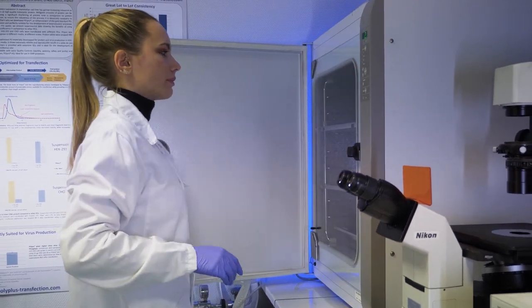Chemical transfection is the best technique to genetically modify cells while maintaining good cell viability. Chemical transfection is easy to apply in the lab, scalable, and efficient in a wide variety of cells.